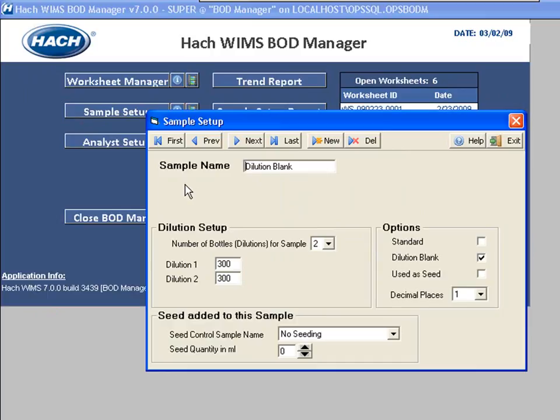Now if you've run the wizard already — the first time you run the program it asks some of these questions — it's already set this up. In this case I already have dilution blank, the number of bottles is two, and I'm running 300 milliliters of each. I check off the dilution blank option over here.